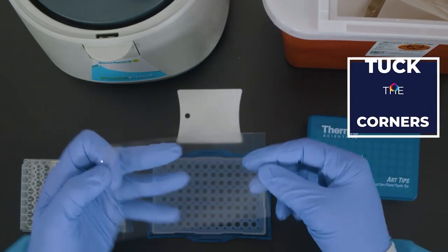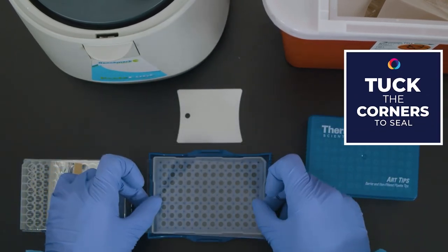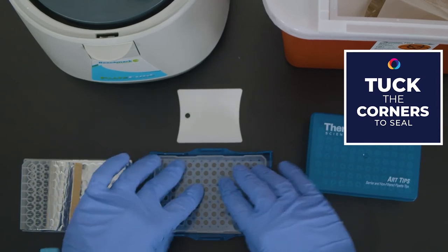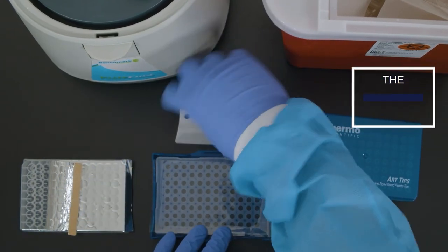Seal the plate. To seal the plate, use the applicator in a back and forth direction, tucking in the corner edges and creating an inner seal around the perimeter of the wells.